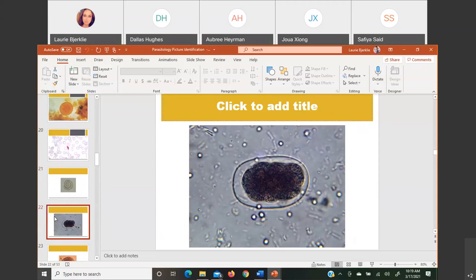I just drew a blank on what I put here. Oh, I remember what it is. I think this is a new picture for you guys. It's a tough one. I made this like 2 years ago. I have to remember what I even made. I put a new picture. It is a worm. It is a hookworm egg.